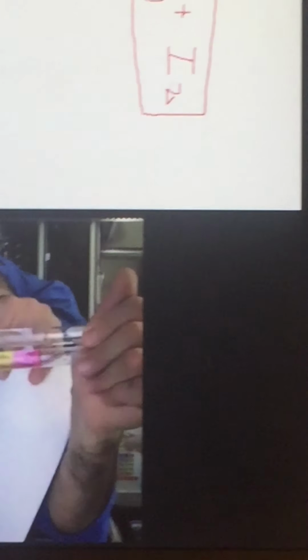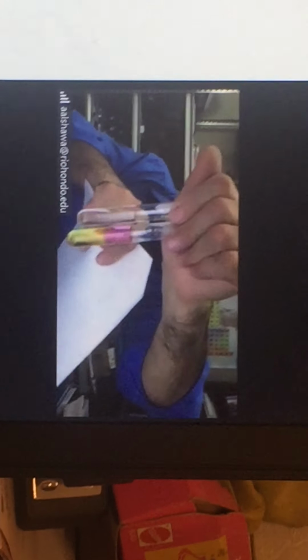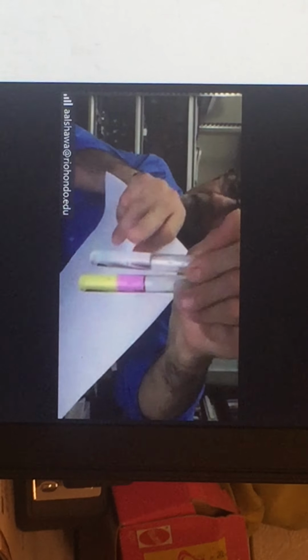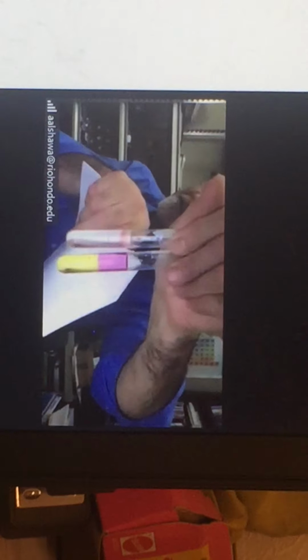One more time. On the right-hand side, from your point of view, there's a reaction. Why? Because I've added the clear chlorine solution into that unknown, and then I've added the hexane layer, and I end up with that pink color in the organic layer. So there's a reaction. If there's no reaction, the chlorine would not break apart as chloride. When you add the hexane, it's going to migrate into that top layer and show this color, clear. So there's no reaction here, and this is a reaction.